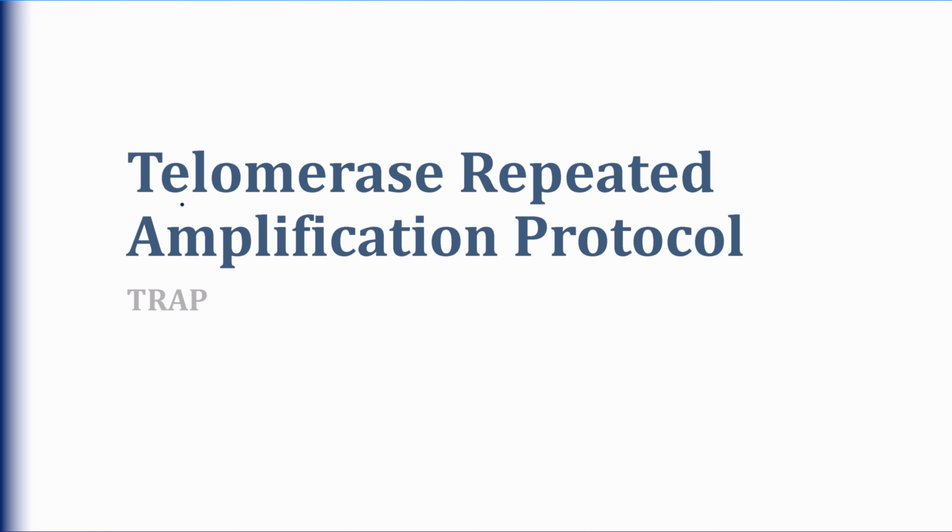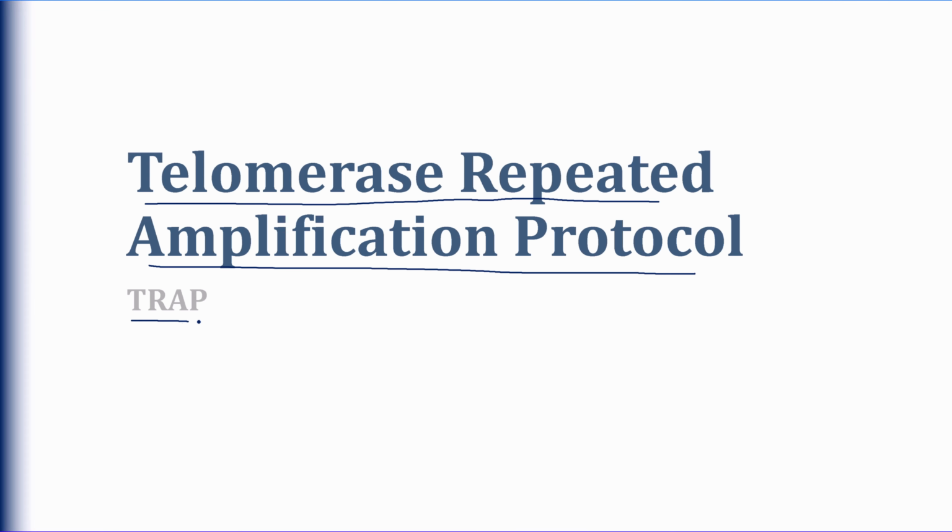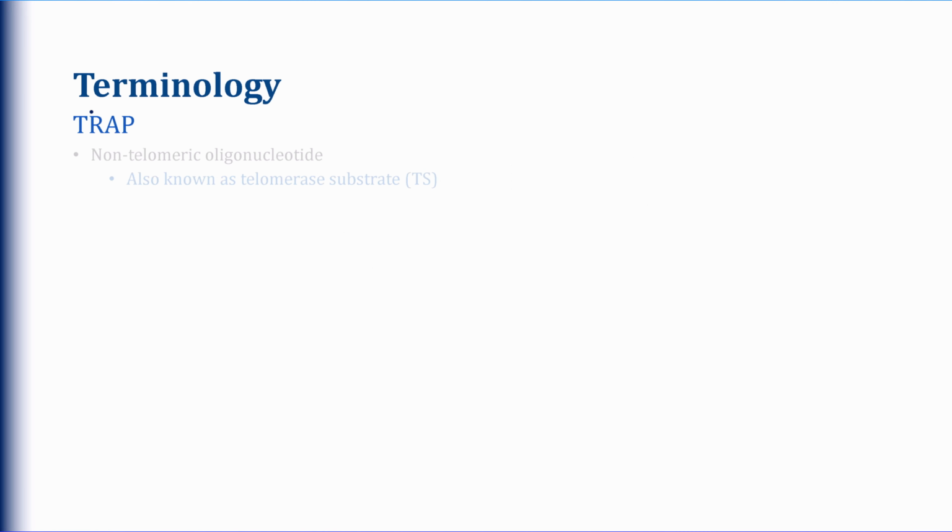Hello everybody and welcome to this module on telomerase repeated amplification protocol, or TRAP for short. Let me begin by discussing some important terminology. I'll be discussing non-telomeric oligonucleotides. These are known as telomerase substrate, or simply TS primer for short. So you have to keep this in mind throughout this module.